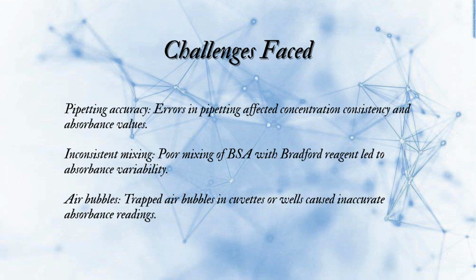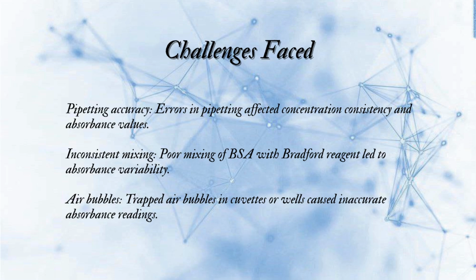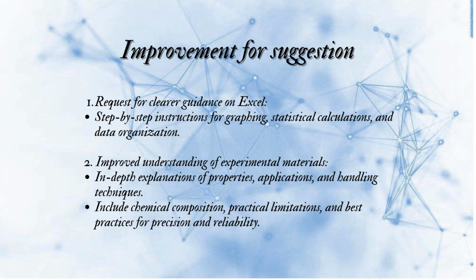There are some challenges that we were facing while doing the experiment, which is the pipetting accuracy, where errors in pipetting affected concentration consistency and absorbance values. And next is the inconsistent mixing, where poor mixing of BSA with Bradford reagent led to absorbance variability. And lastly is the air bubbles that get trapped in cuvettes or wells that cause inaccurate absorbance readings.